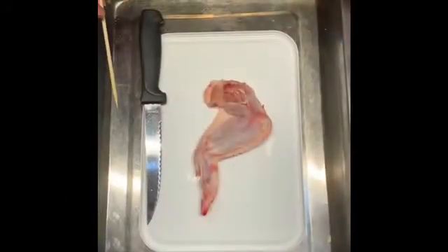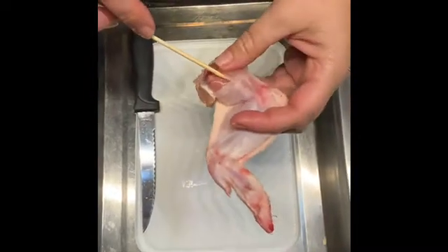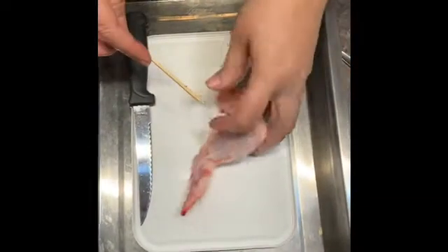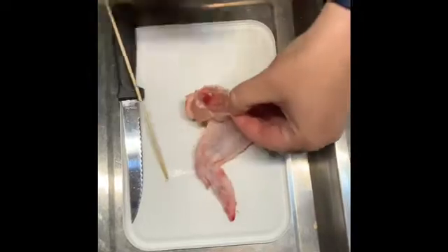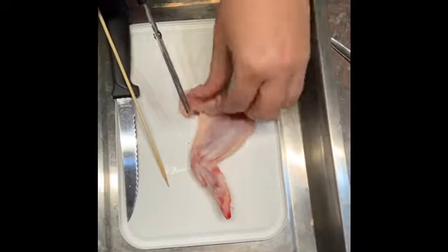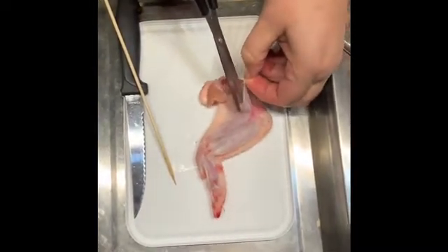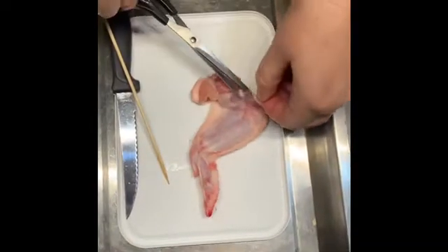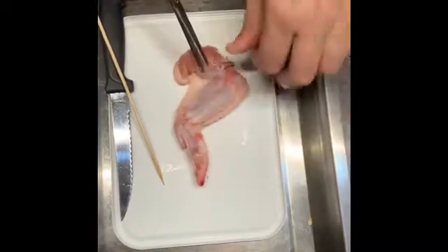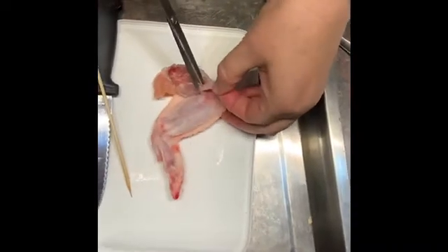We're going to try and remove the skin. Because this joint has been cut open, the skin has already been loosened a little bit at the top, so all we need to do now, using your scissors or whatever you have at home, is to slide underneath the skin and loosen it. Be careful not to cut the muscles underneath. Take your time because this does take a while to remove the skin from the underlying tissues.